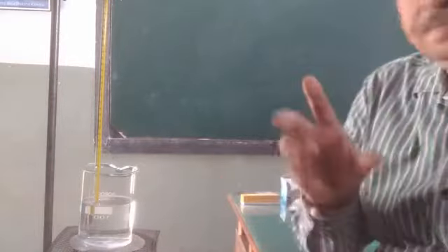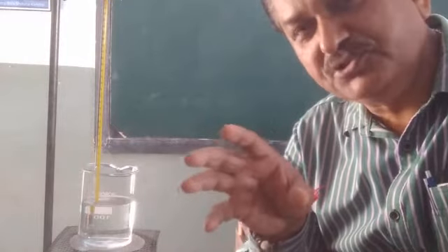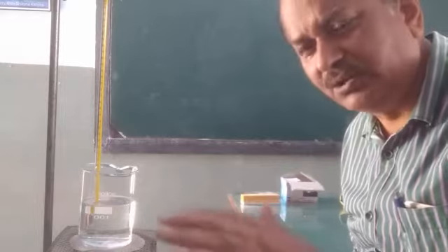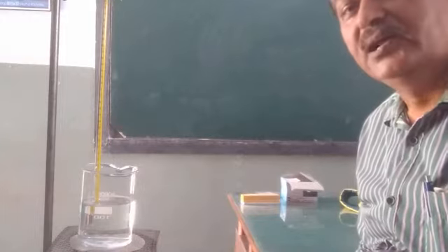So now children, after some time, you can see water will come out, vapors will come out. So I was talking about wire gauze. Wire gauze has a coating of fireproof material, and it is called asbestos. Asbestos is a mineral. Asbestos is obtained from the mines like clay, and is fireproof. On the simple wire gauze there is a layer of asbestos. Asbestos prevents sudden heating.